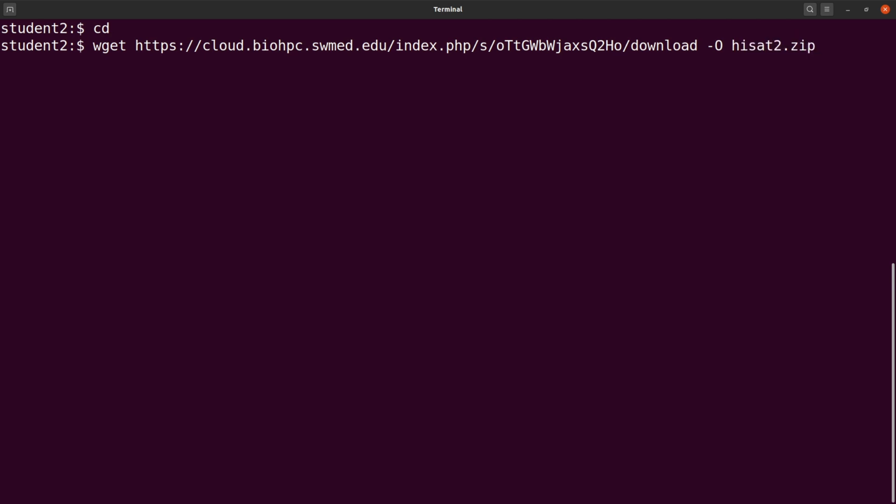The reason why I am adding this is that when you download, this is the name that will be given to the file. This may be confusing, so I add this so that after download, the file will be renamed, and then we will have it this way. I just want to add the extension. So let's download now.